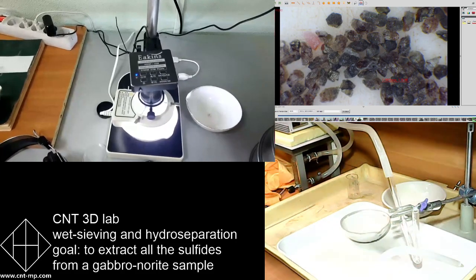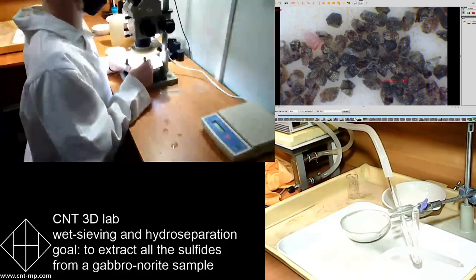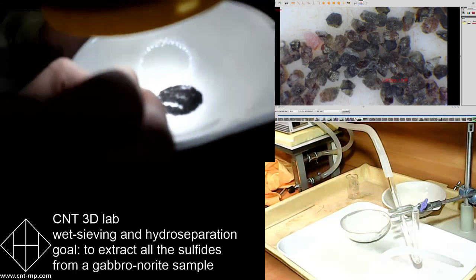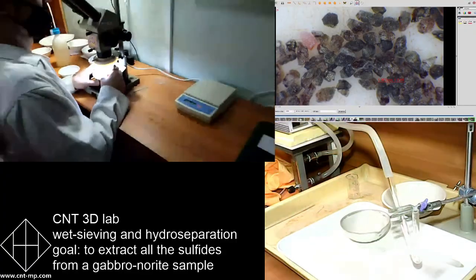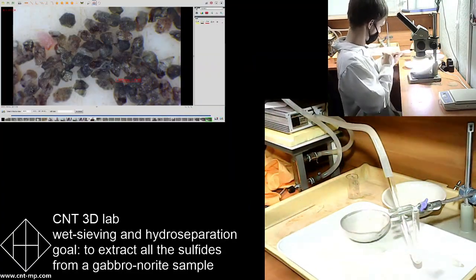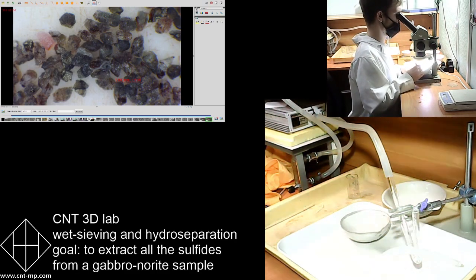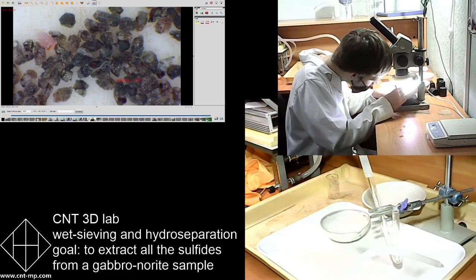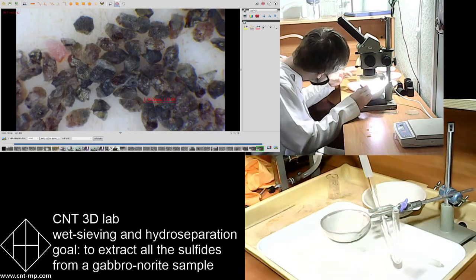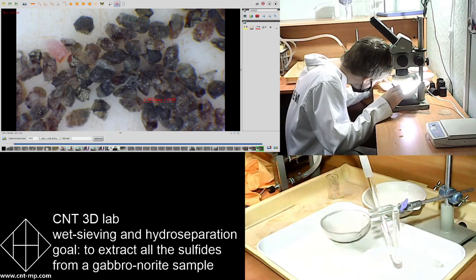So that's magic that happened. We had that 1 kilogram sample. We've processed it through EPD, 2 types of EPD. This one definitely was recovered in EPD's part 2 stage. There are large pyrite particles. So we didn't expect this to be so coarse, minus 300 microns plus, I guess, 125. So they're quite coarse. So we expect many more sulfides, not just pyrite, but many more others.